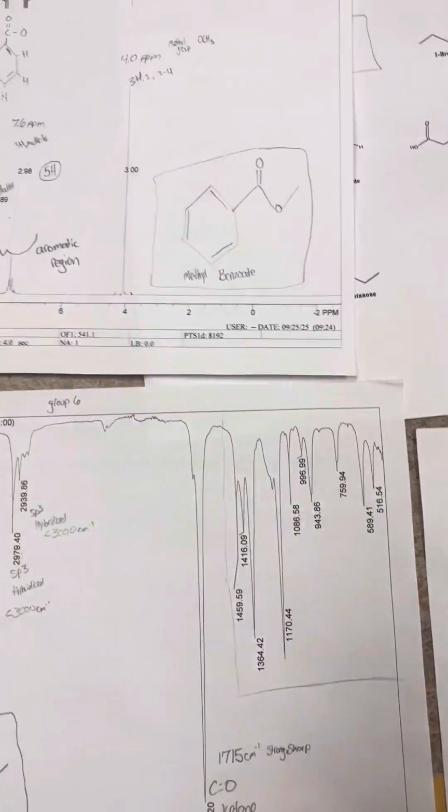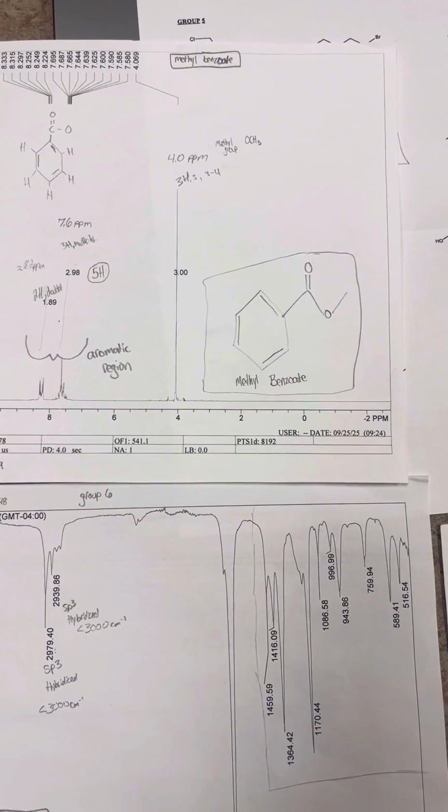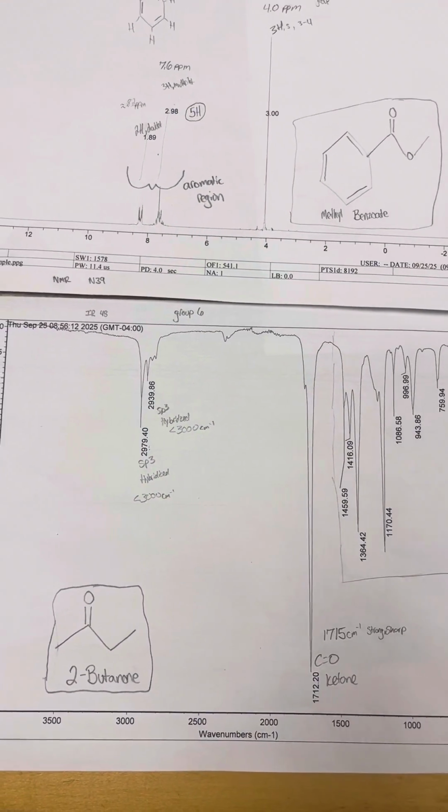And with that, our 2 unknowns: methyl benzoate and 2-butanone.